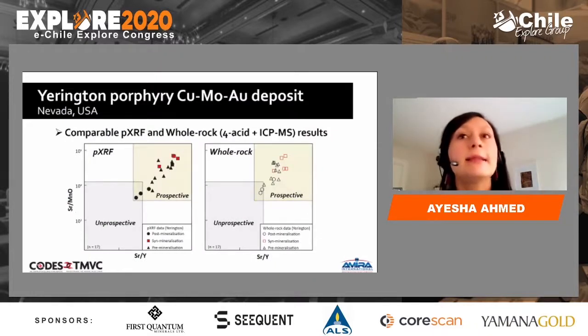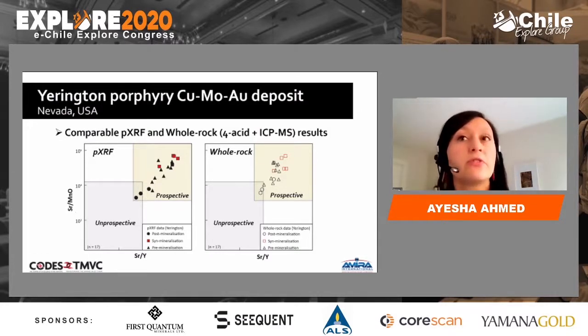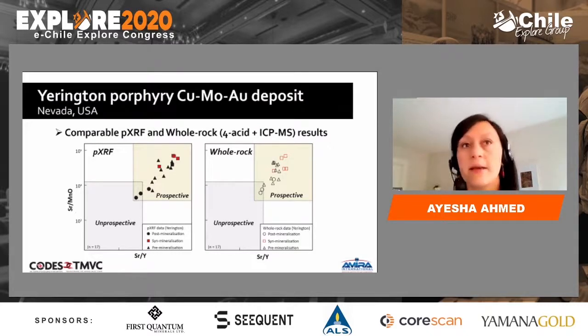This slide really highlights the excellent correlation between PXRF and whole rock data from the same samples. So what you can see is that both absolute values and patterns, relative patterns between pre-syn and post-mineralization intrusions are preserved in the PXRF dataset compared to the whole rock dataset.